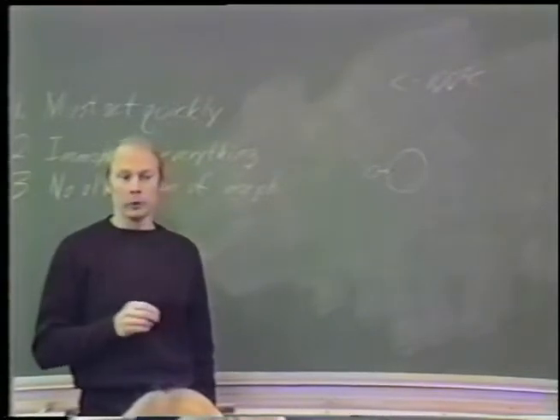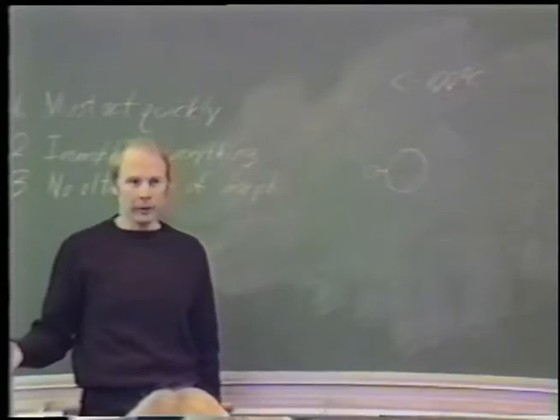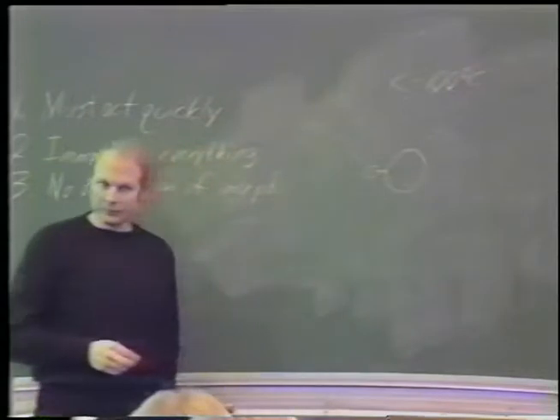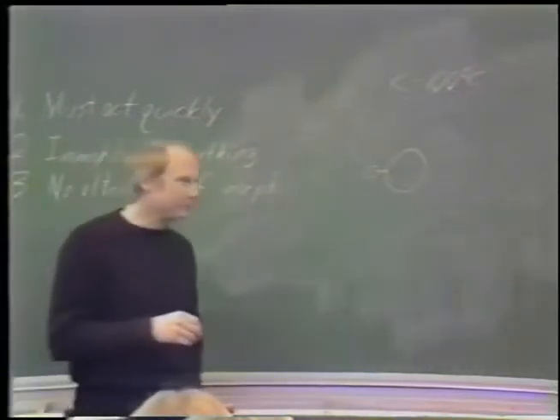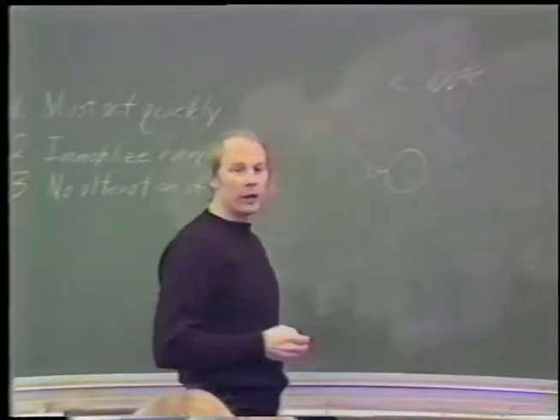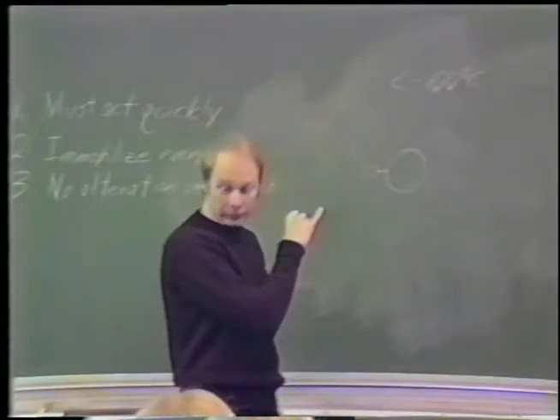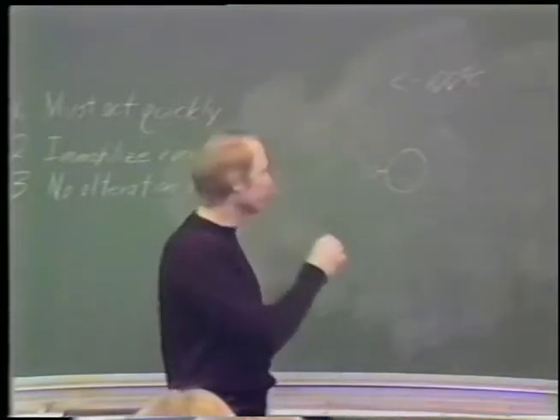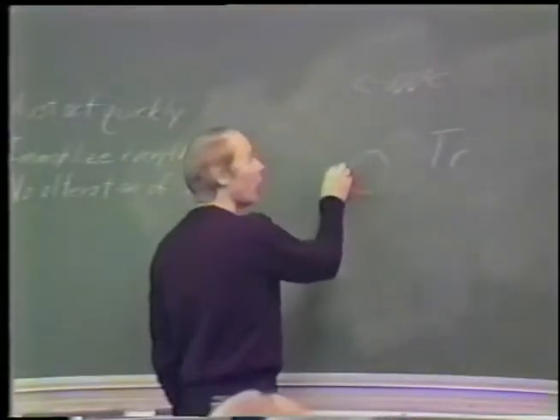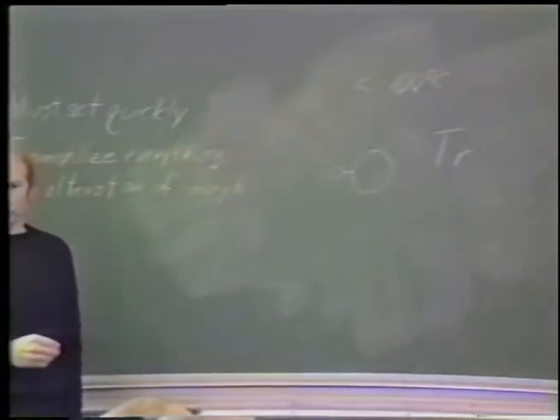Those will reorder to form ordered domains above minus 130 centigrade in pure water. In biological systems that contain solutes, the estimate was around minus 100 centigrade. There's a little more evidence for that we'll discuss later. But since biological systems are not vitrified, you don't have to worry about the temperature of devitrification. What you have to worry about is the temperature of recrystallization, Tr. That's the point at which a system that already contains ice crystals will begin to rearrange to form larger ice crystals.